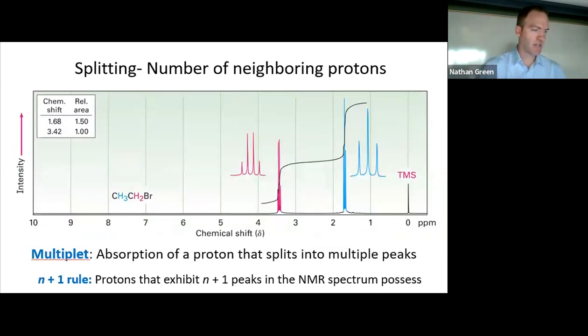Bless you. The splitting is also a way of talking about the number of neighboring protons. I think this is probably the hardest part of this, and depending on the type of spectrum you have, it can be helpful, or sometimes the splitting pattern isn't going to be useful to you at all.